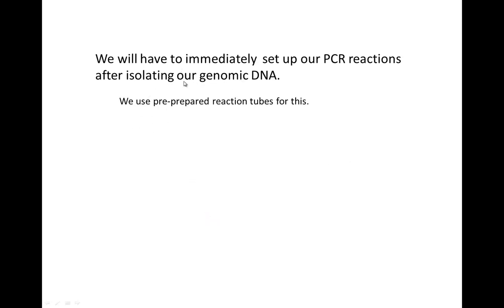So we're going to use pre-prepared reaction tubes. That comes with some stuff already in the tube. These are dNTPs, and the N is shorthand for adenosine, thymine, guanine, and cytosine. So all 4 of your bases, and they're dNTPs because they're deoxynucleotides to make DNA. And a 2x pH ionic buffer. There'll be 25 microliters volume in here already.